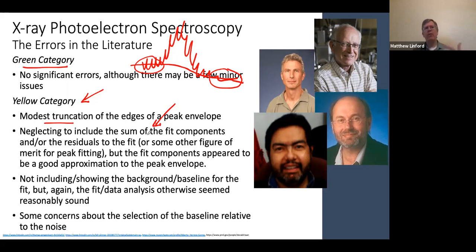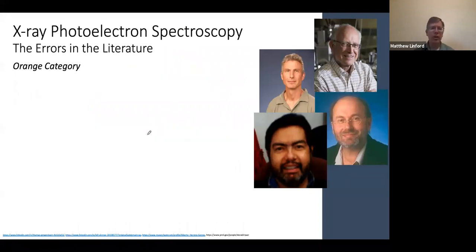One of the reasons I'm going through these issues is it gives you a flavor for some of the key issues that are associated with XPS, with XPS peak fitting, which again is so important for extracting that chemical information from the technique. And this also gives you a sense for the type of topics that would be covered in more detail in a more complete class.